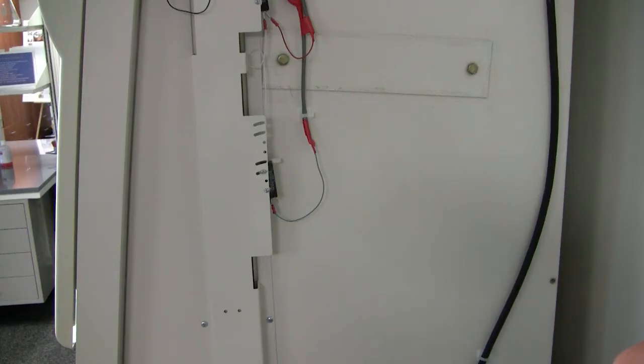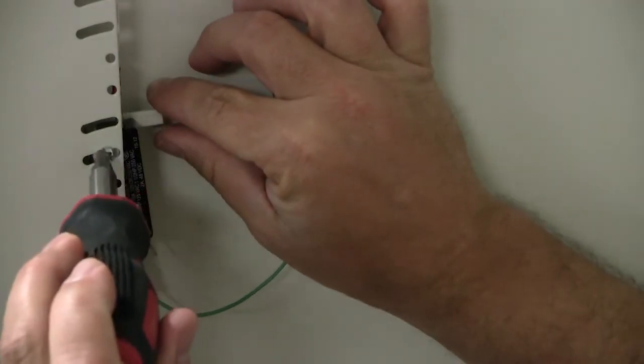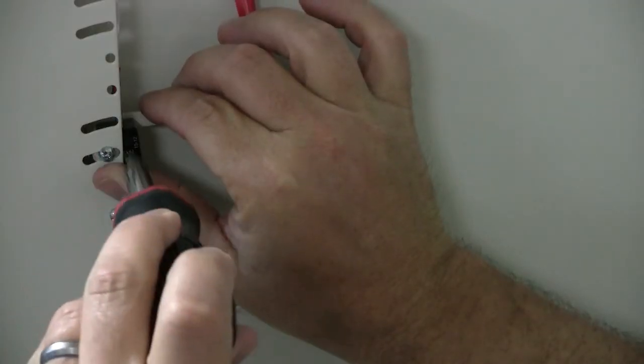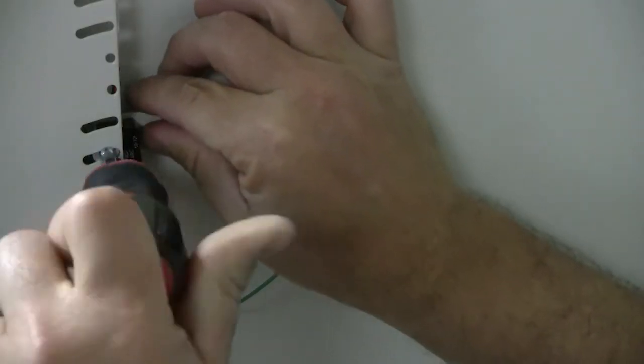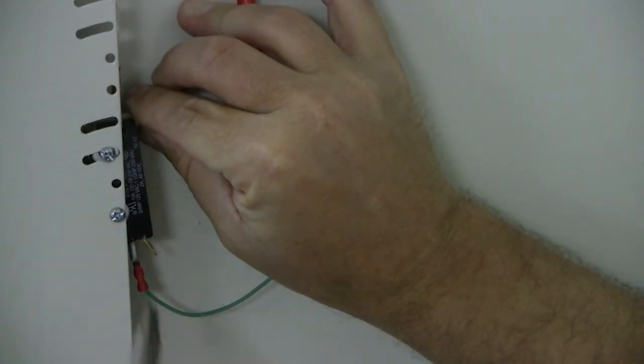Begin by checking the wires attached to each switch and confirm they are securely attached. To adjust the switch, loosen the upper Phillips head screw attaching the switch to the BSC. Then rotate the micro switch in or out to engage the roller arm as it passes over the counterweight insert.